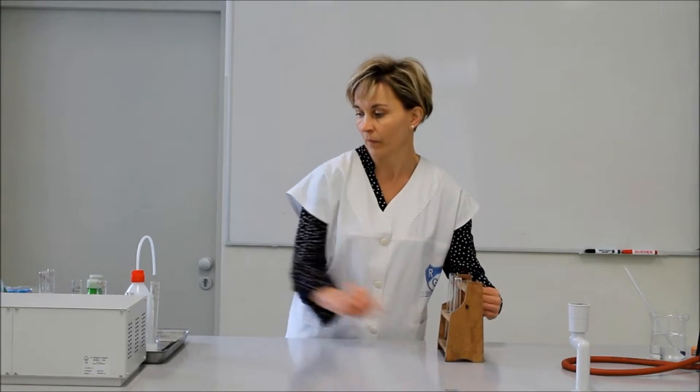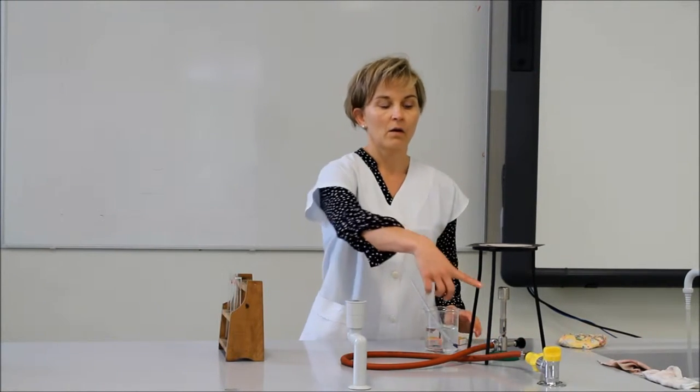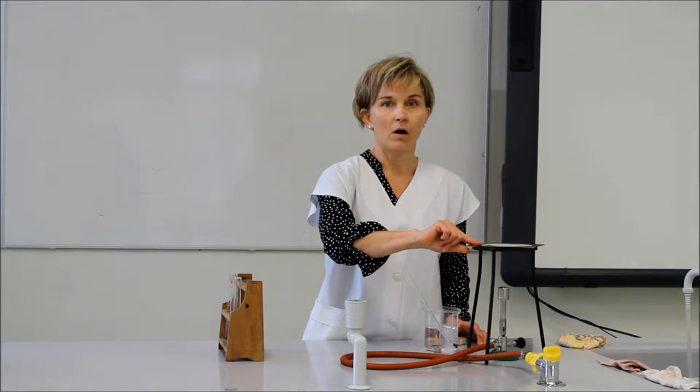Az eszközeink: kémcsőtartóállvány kémcsövekkel, csipesz, szike, két mérőhenger – 25 köbcentiméteres, illetve 10 köbcentiméteres térfogat mérésre alkalmas – a vízfürdő előállításához szükséges eszközeink: bunzenégő, gyufa, vaslábháló, aszbeszt drótháló, nagyméretű főzőpohár, benne víz, illetve hőmérő.